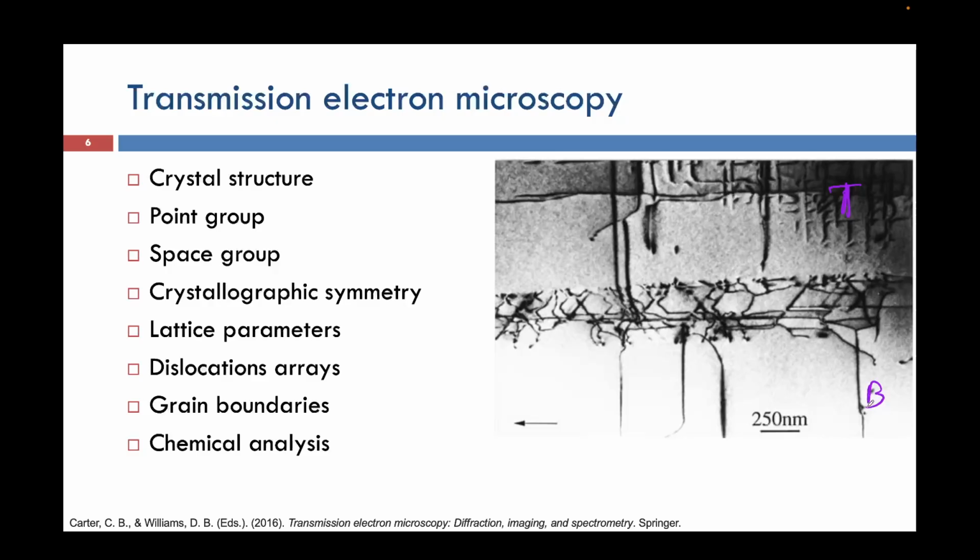We cannot say that in the material itself. It appears from this micrograph that this is the top portion, with a step kind of structure, and below it is the bottom portion. Though it appears as a step-like feature, in reality it is not the case.